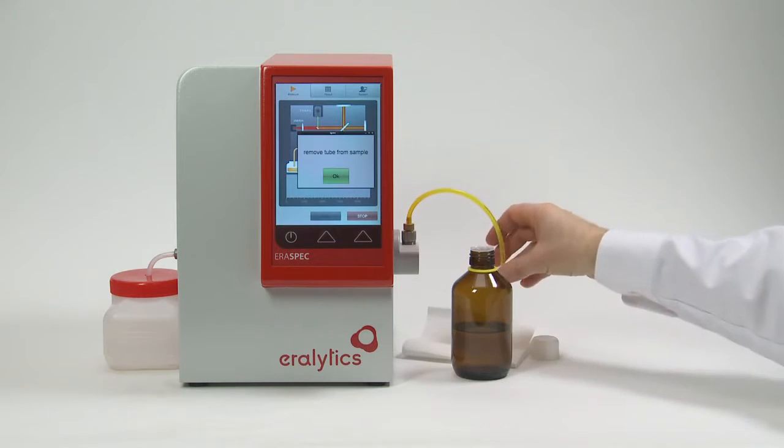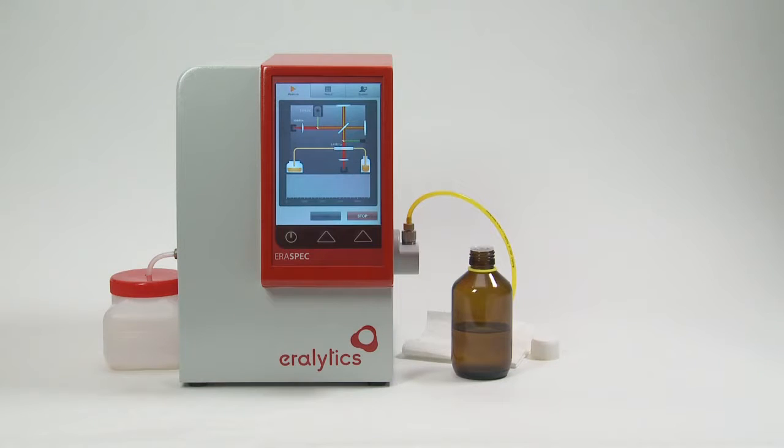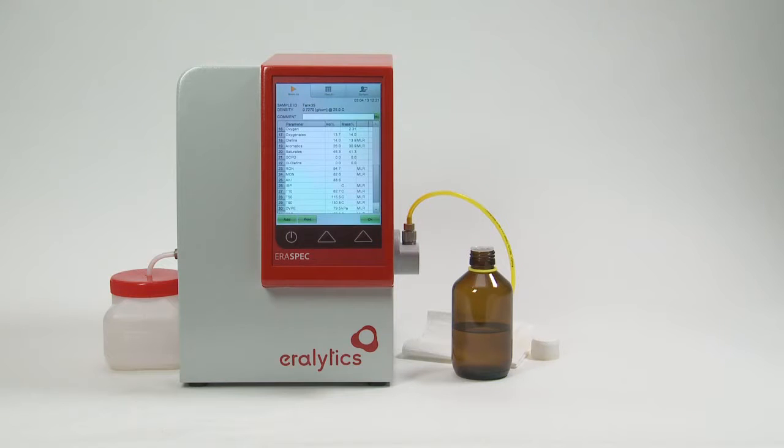When the system is completely filled with sample, please remove the inlet tube from the sample container and confirm this on the analyzer. Aerospec now measures the IR spectrum. At the end of the measurement, the sample is pumped out of the system and the result list is displayed. The total measurement time is about one minute.